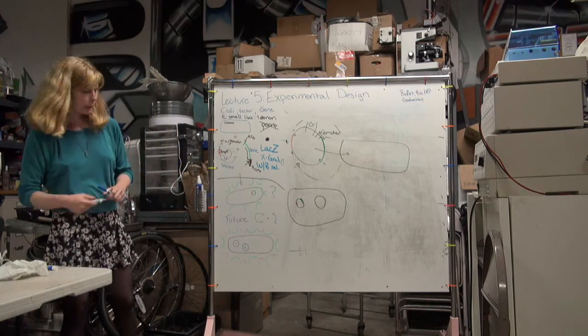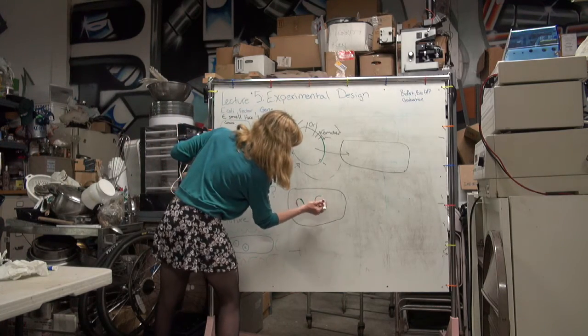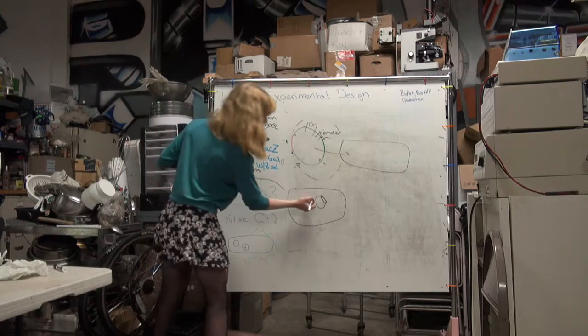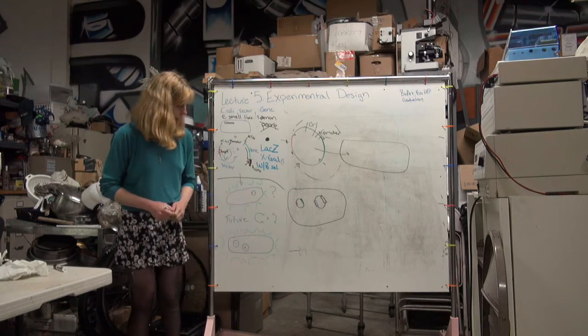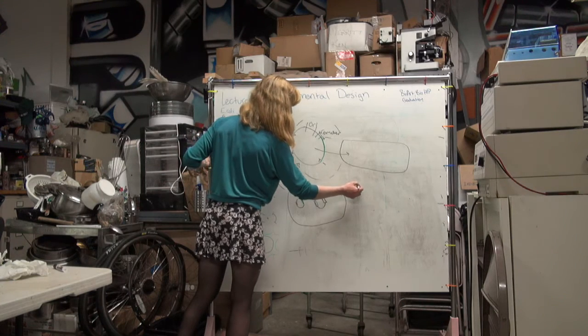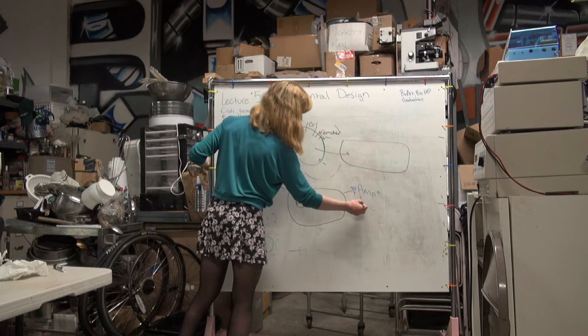It's fine. Be creative. That has our second gene of interest, which is represented by this brown, which I'm going to make a box. And then kanamycin resistance, which I'm going to make a box too to differentiate it. So this E. coli, we would know it had both the plasmids because it's plated on ampicillin and kanamycin.